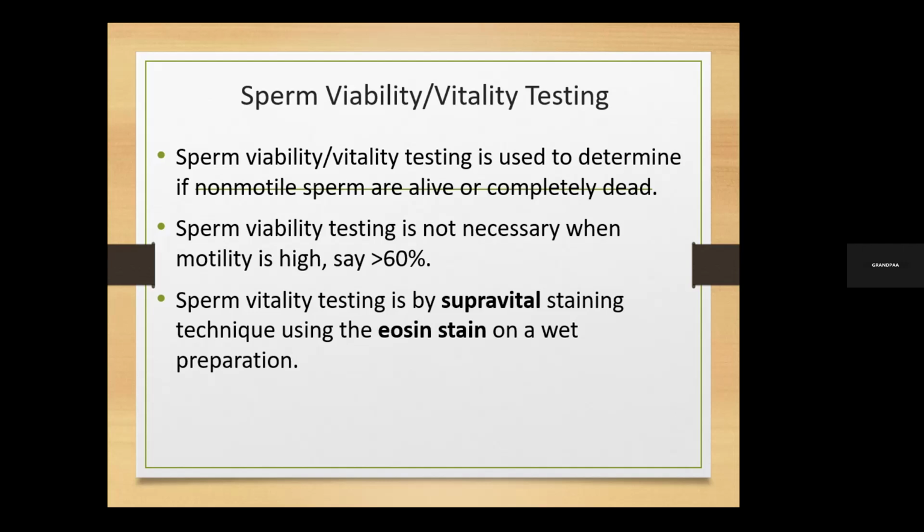Now, the eosin test, as we move ahead along, has been modified to include a second stain. But the routine, simple one will be the eosin test. And here it is a wet preparation. Take note, eosin test alone is used as a wet preparation. So you have your eosin reagent. You take a drop of the eosin and examine. I'll take you through how you're going to do it.